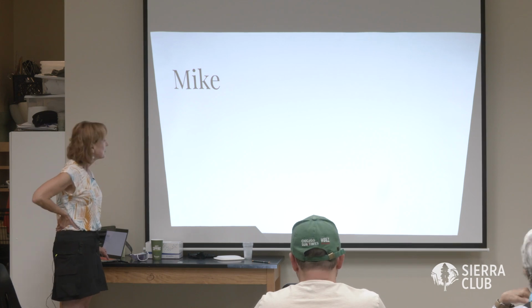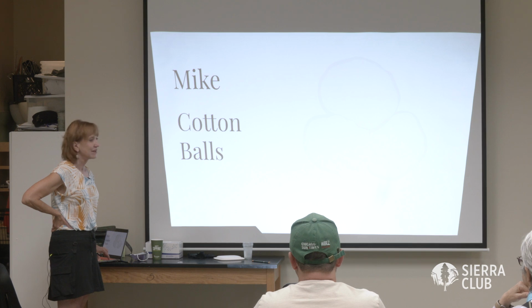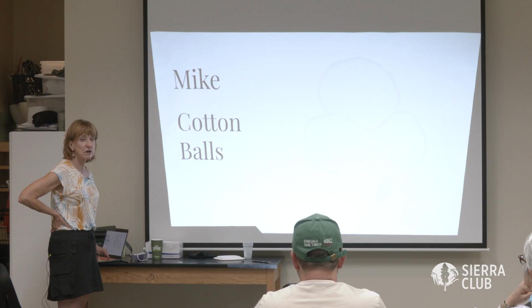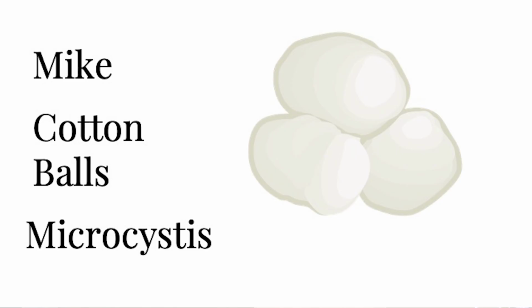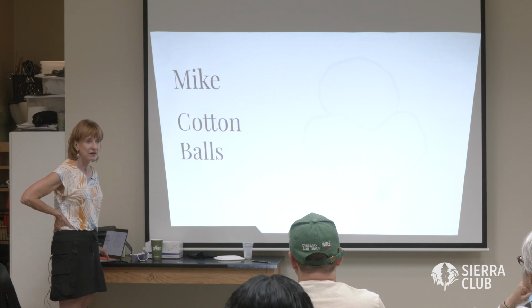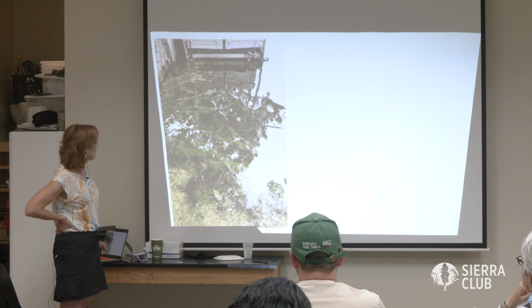All right, Mike. So when you hear Mike, I want you to think of cotton balls. And Mike is short for? Microcystis. So yes, it is a colony. Mike, what do we think about? Cotton balls. Mike is short for? See, you know it.